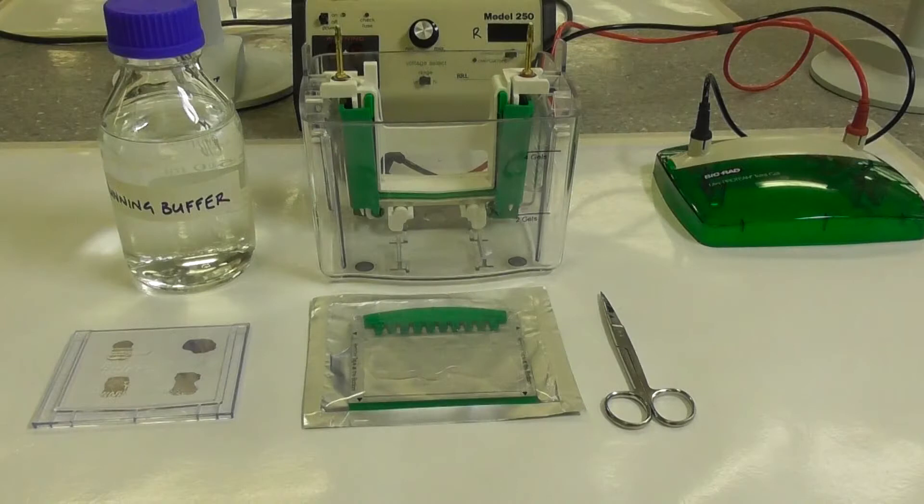While the samples are heating the gel running apparatus is assembled. This consists of a gel tank, denaturing running buffer and an appropriate denaturing gel. Here we are using precast gels.